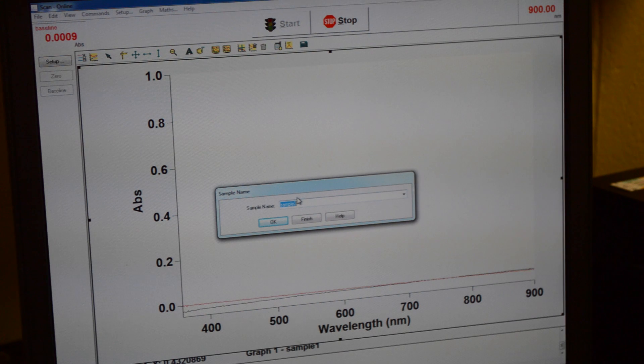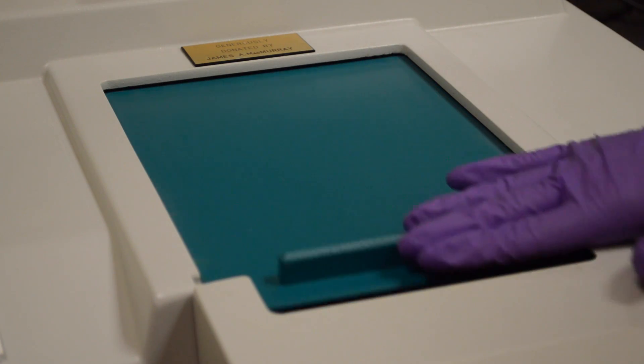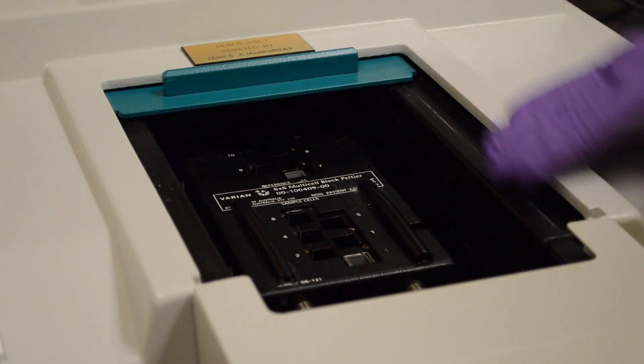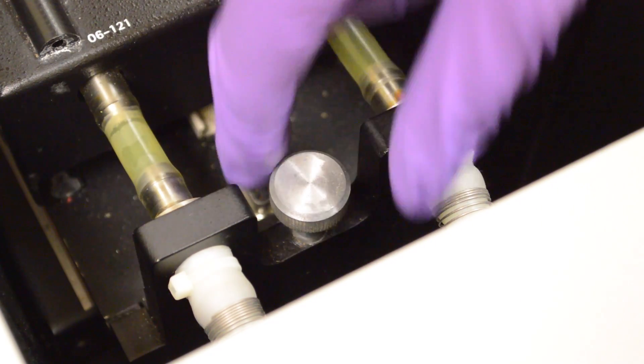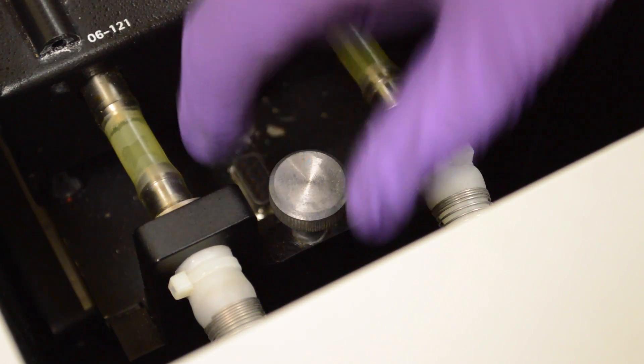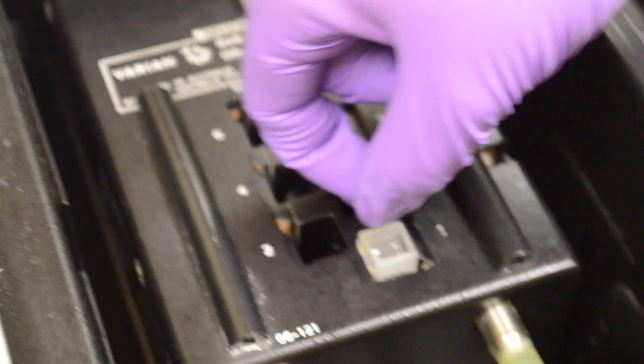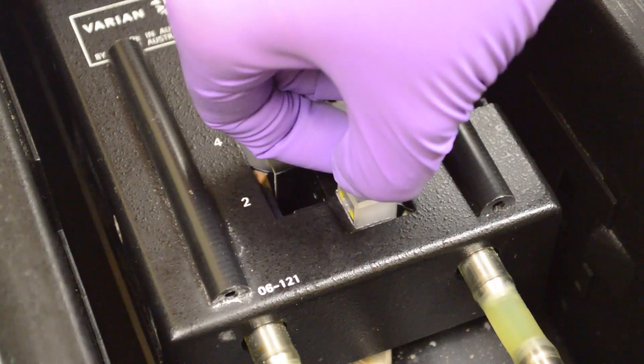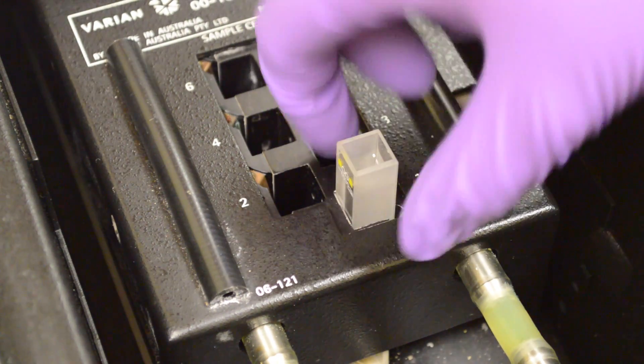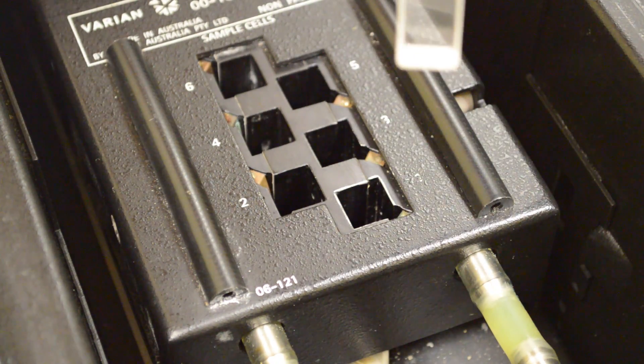From here we are going to put the sample into the UV-vis spectrometer. You're just going to slide the top of it open and to get out the sample there is a little silver knob here. You're just going to lift up and that will pop the cell up so you can retrieve your cuvette. You take it out through the frosted sides the same way you put it in and you can just properly dispose it in a waste bin.